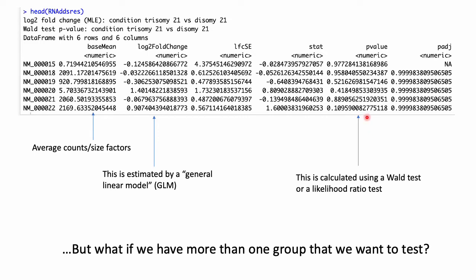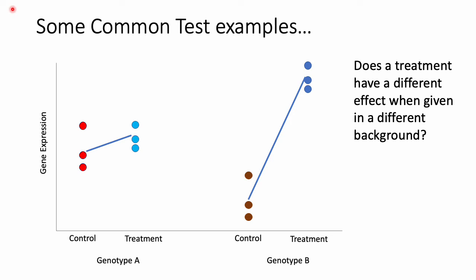But this setup was limited to only the most basic pairwise comparison, where our samples can fall into one of two groups. Today, we'll learn how to incorporate more complex design elements into DESeq2. Here are some examples of the designs we'll be exploring today.